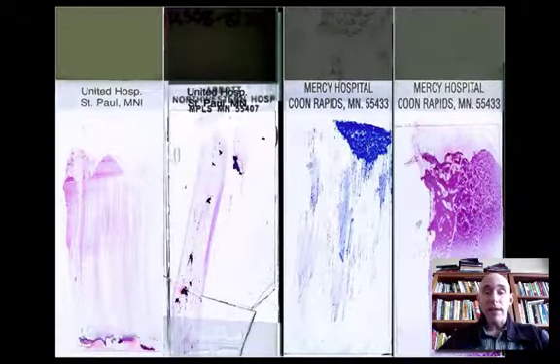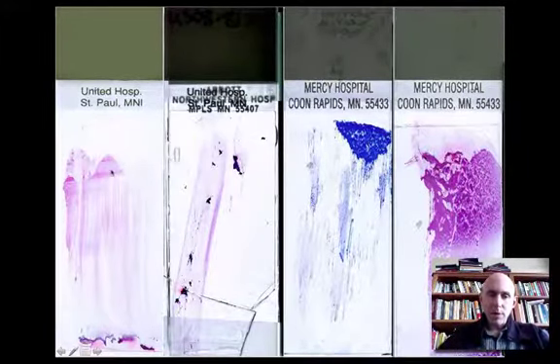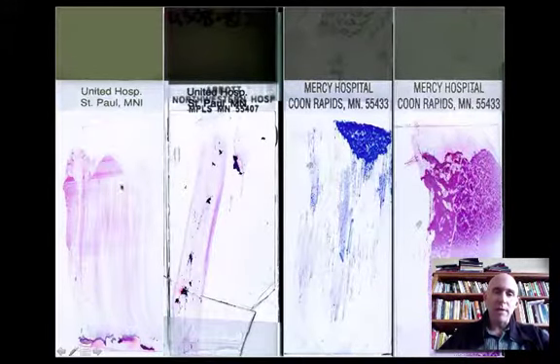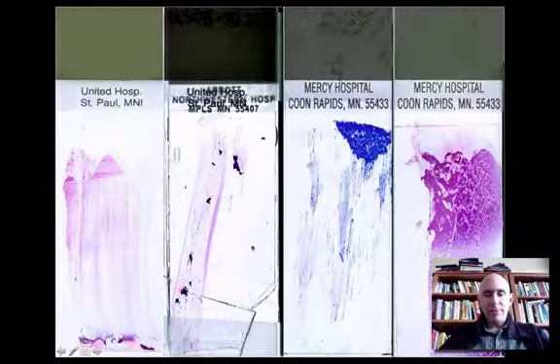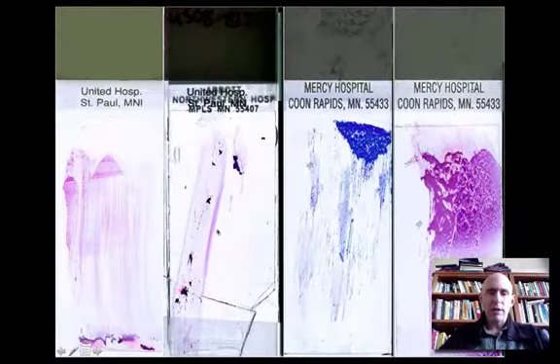These smears, on the other hand, have various defects. It's simple, the smear procedure, but there are some foibles. It's easy to put your tissue down, disperse it with the other slide, but then road grader it off, sort of in the manner in this left-hand panel. If you're not careful, you can break the slide. You can apply too much pressure and cause all kinds of artifacts subsequently.